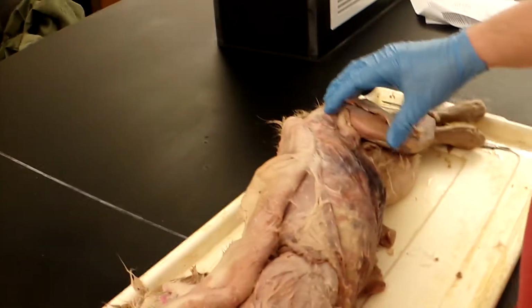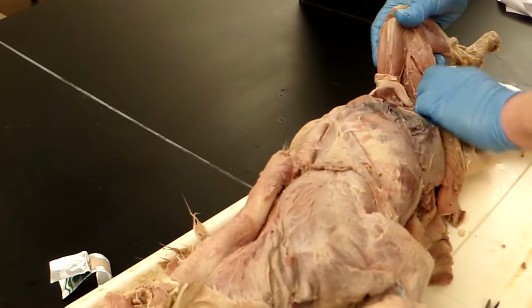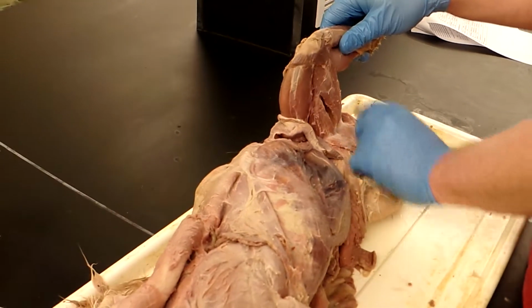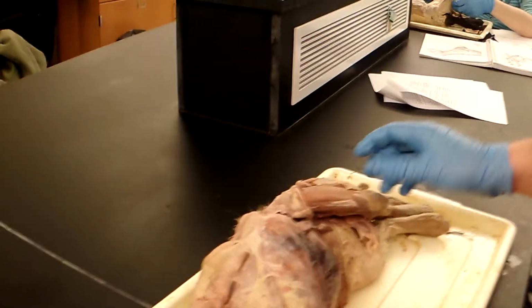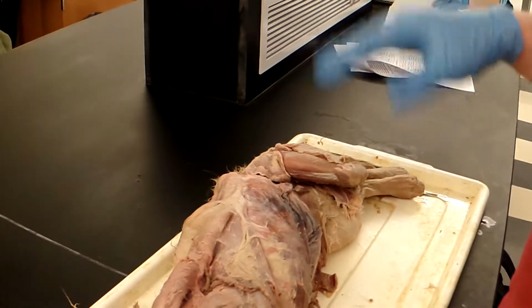The gracilis is located right here. This is underneath. The origin is the pelvic symphysis. The insertion is the tibia, and the function is that it adducts and retracts the leg.